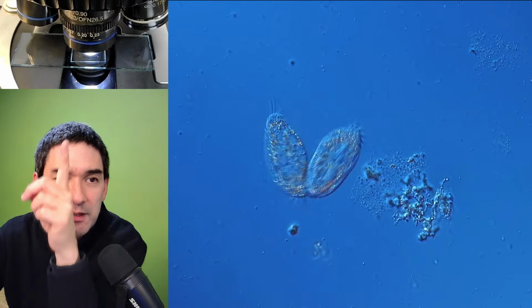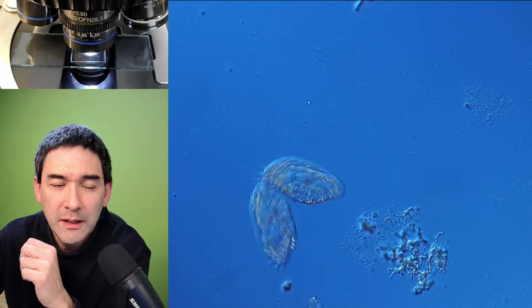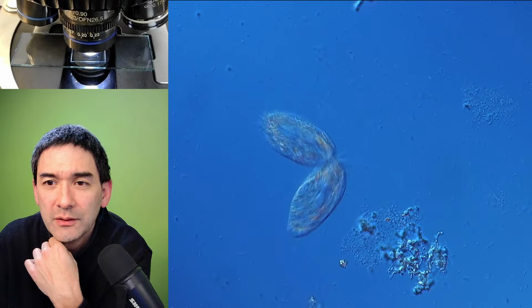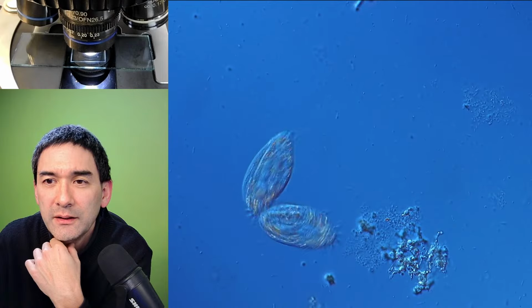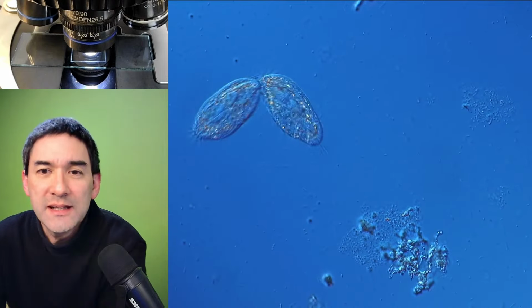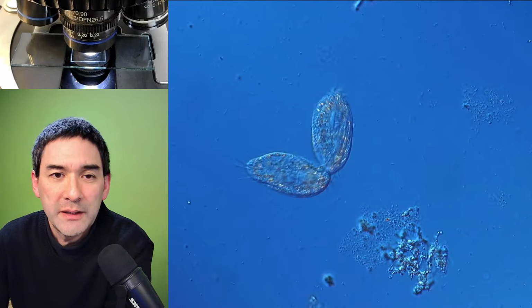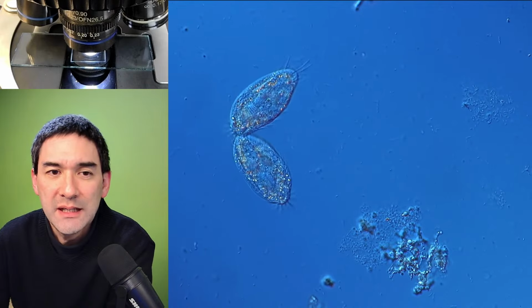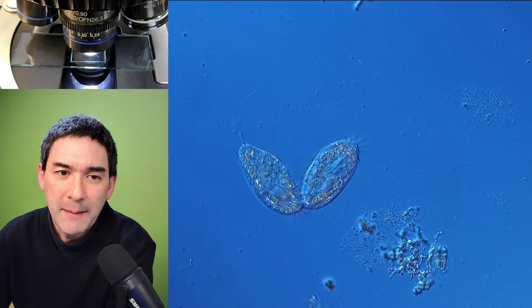This is 60 times. Okay, I need to quickly go back to your previous question, if I can find it. Did you get my recent email? Ah, yes, thank you. Yes, I got your email. I did not respond to it, but I read it. Yeah, thank you very much about the enzymes in the sample.